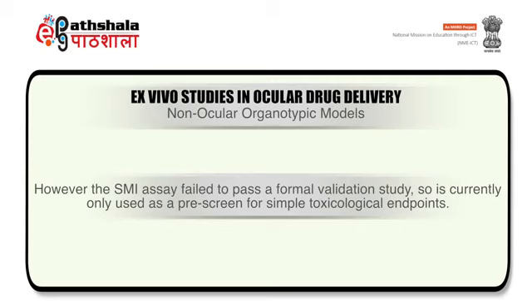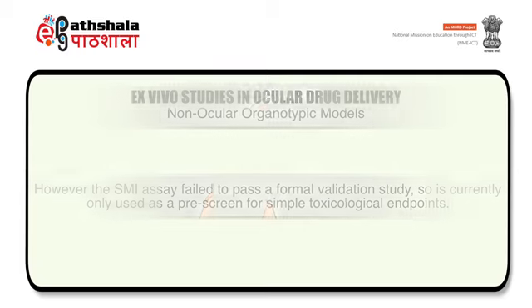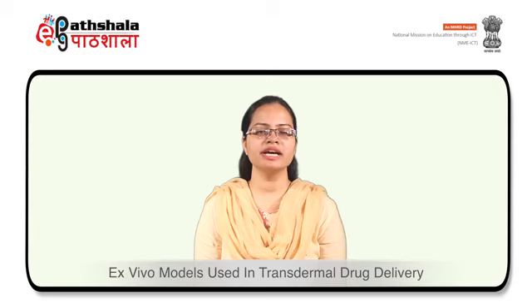However, the SMI assay failed to pass a formal validation study, so it is currently only used as a pre-screen for simple toxicological endpoints. Now we are going to discuss the ex vivo models used in transdermal drug delivery.